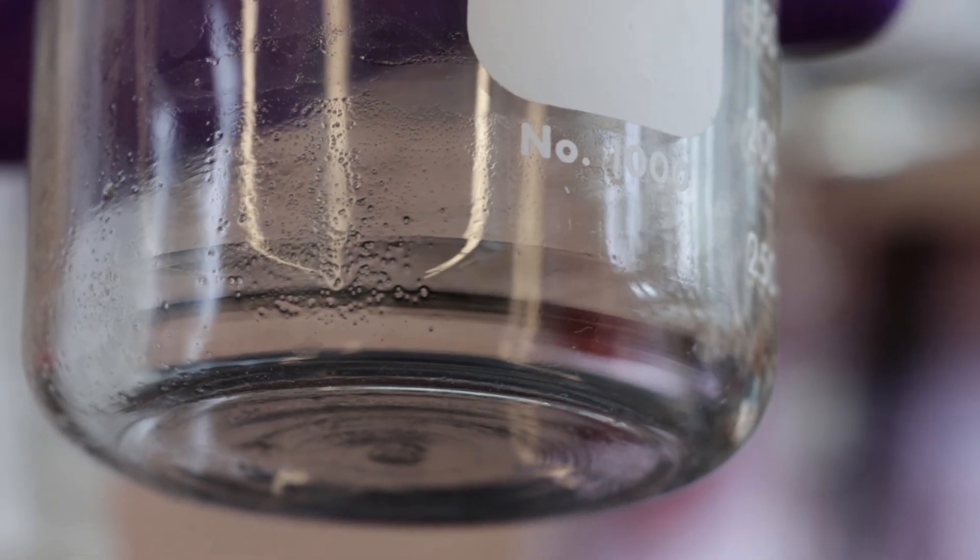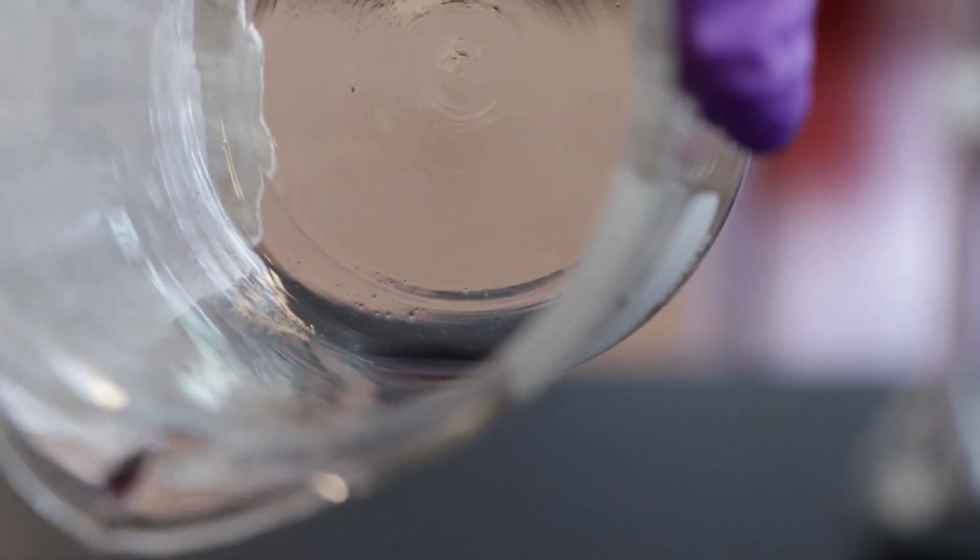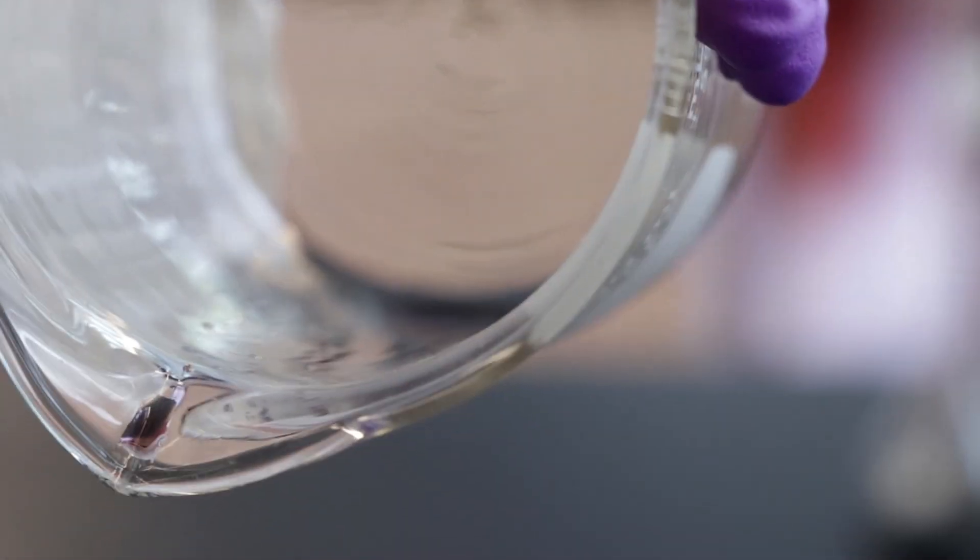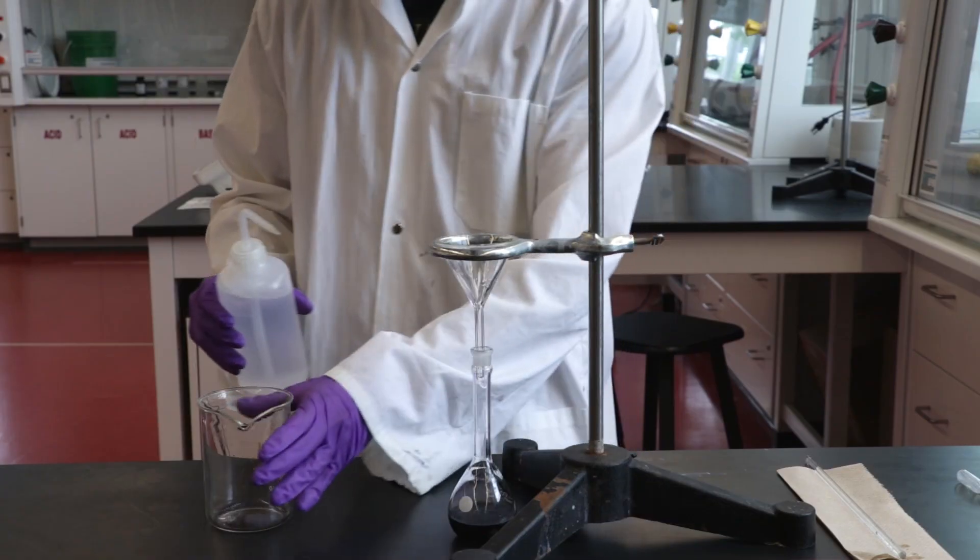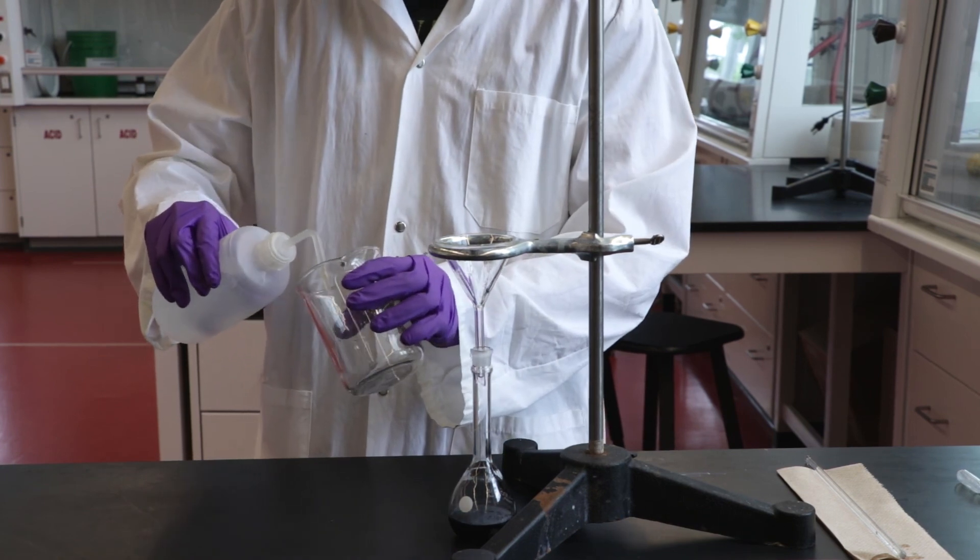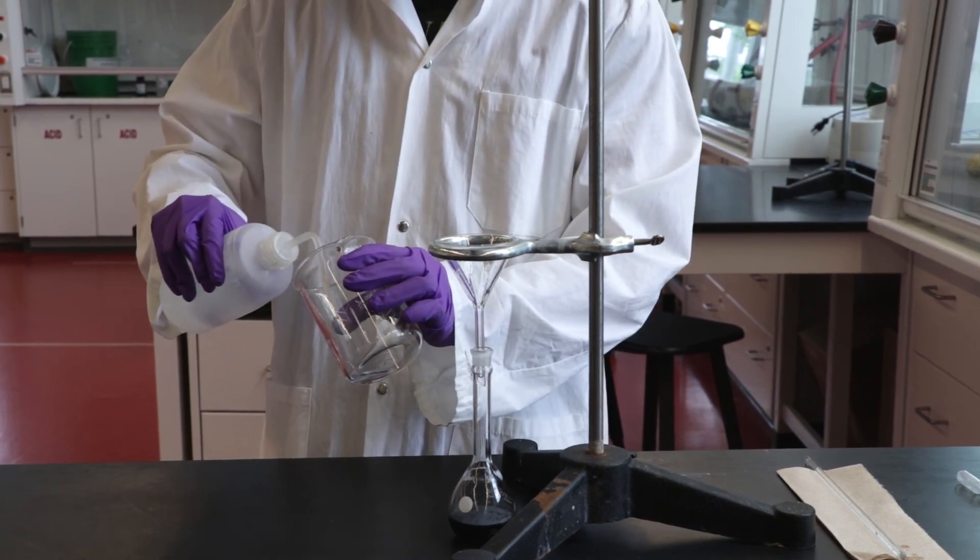Once the beaker is empty you will notice that some residue remains in the beaker. If this is discarded then the solution was not completely transferred. To ensure complete transfer, rinse the beaker with a small amount of fresh solvent and transfer the rinse to the volumetric flask.